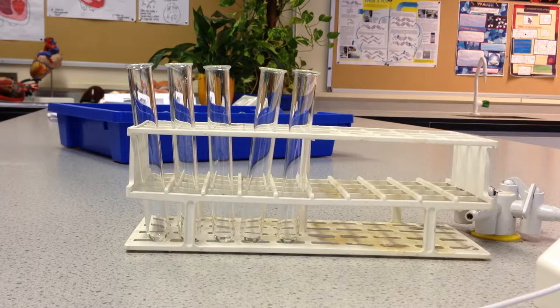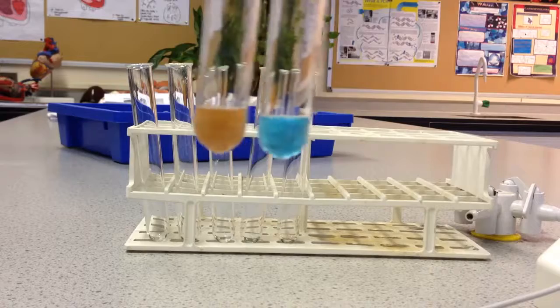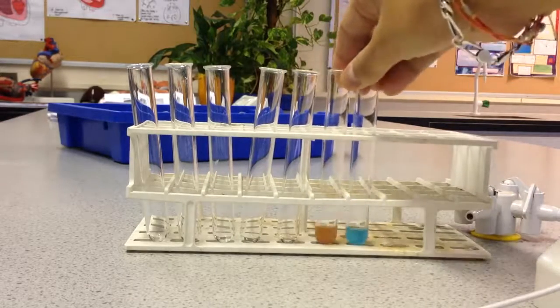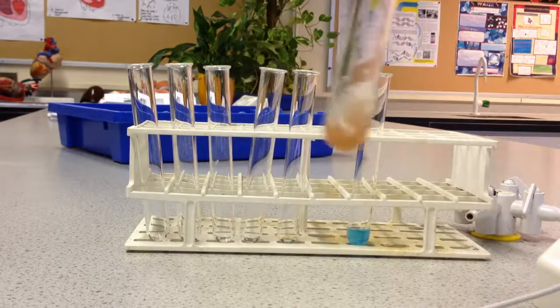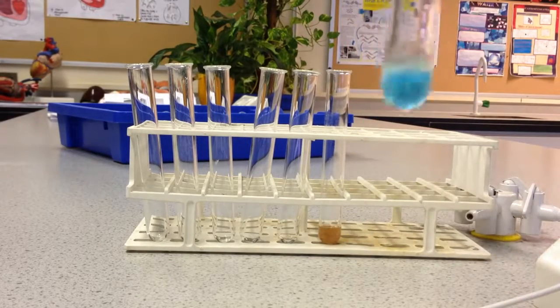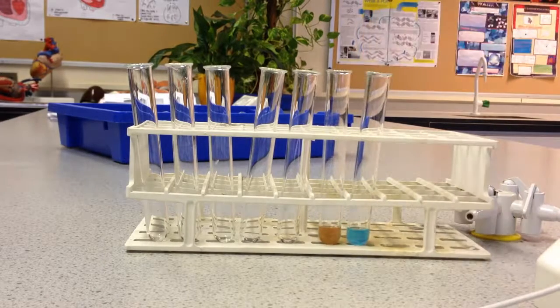And we are back. There we are. So if I can just bring that close up. After about 5 minutes, you can see that when the glucose was present, a nice brick red precipitate has formed, and where we just used water, there has been no color change at all. Okay, so that's the straightforward Benedict's test to check for the presence of a reducing sugar.